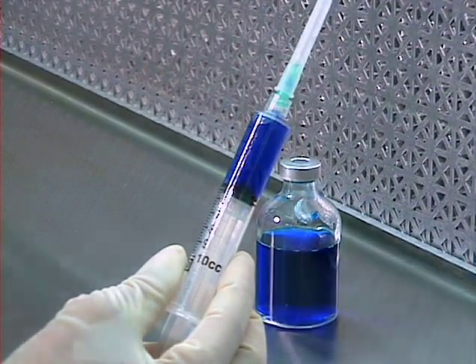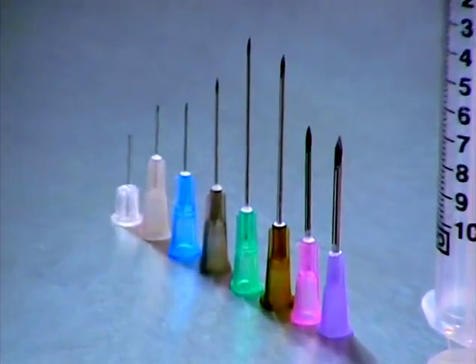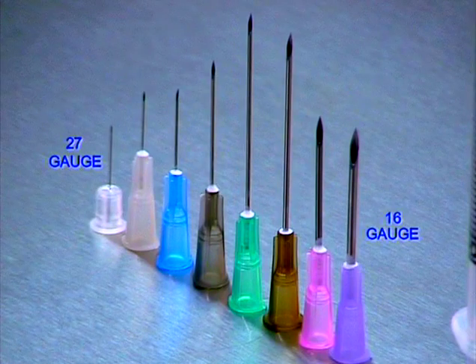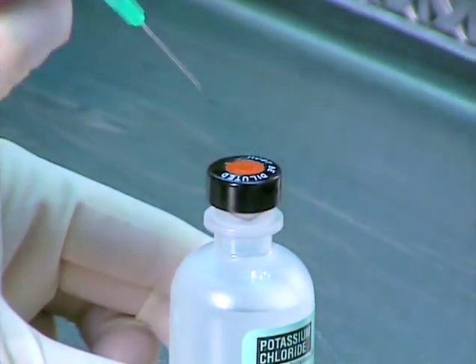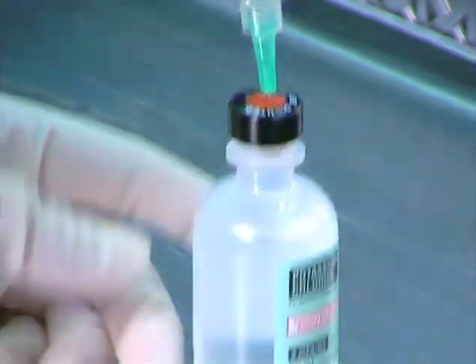The thickness of needles is indicated by the gauge. The higher the gauge number, the smaller the needle diameter. Smaller diameter needles should be used to avoid creating large punctures in the septa, which may not reseal. Also, avoid re-entering the same puncture hole. This increases the hole size and creates leakage and coring.